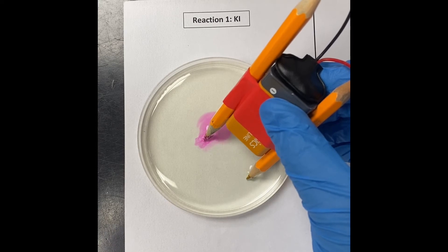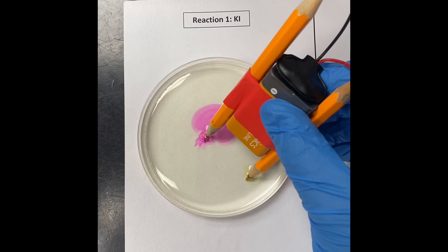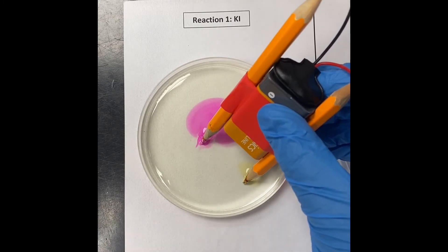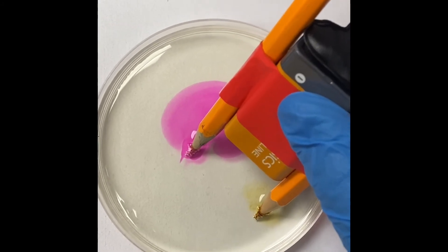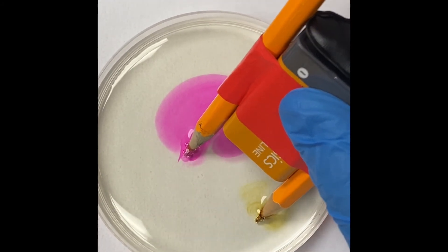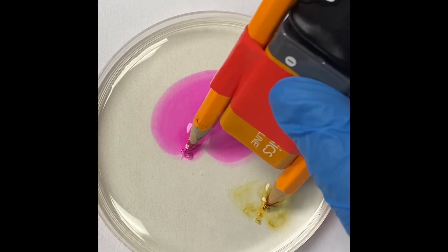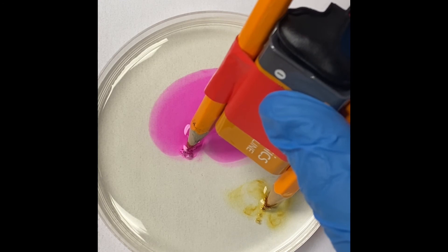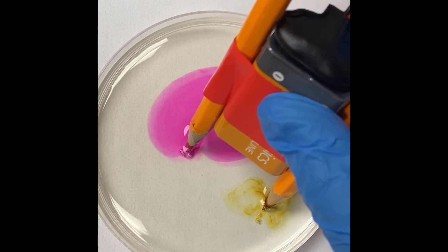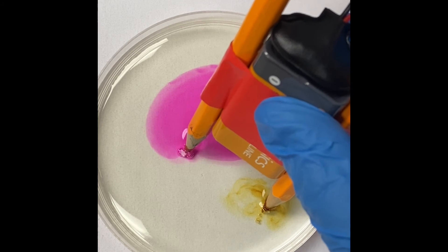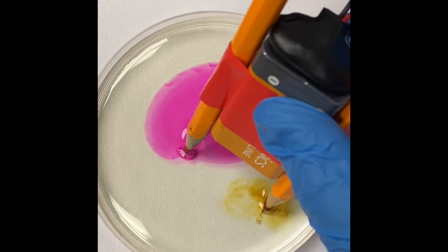Clearly one of the electrodes, you can clearly see some bubbling there, and you see a color change happening. The phenolphthalein is turning pink, and the other electrode, you can see swirls of yellow. So something is happening to the potassium iodide. This is an aqueous solution. So that is what I'm noticing.